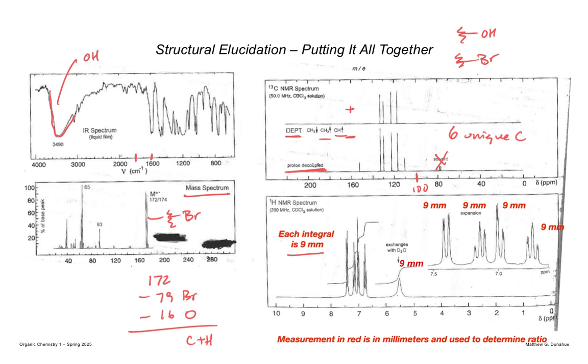So that's your OH group. So OH exchanges to OD, deuterium. So we've assigned that peak. So we got 1 of the 5 done. We have these other 4.